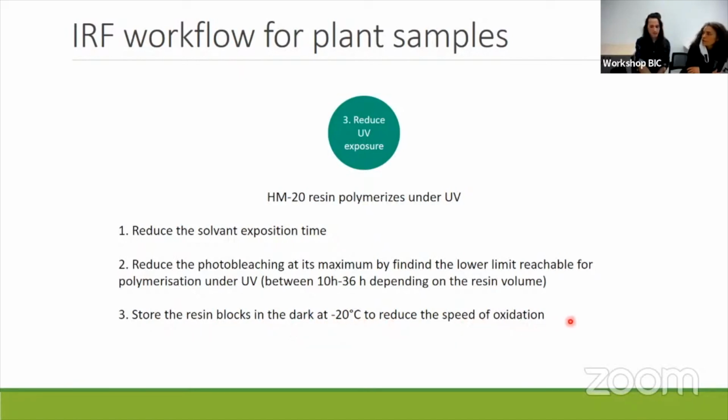We noticed that in samples we made a few years ago, the fluorescence is less visible. So when you do your fixation, try to process your resin samples when you can, and not store them too long. We also have the feeling that the surface of the block is less conserved than the deeper part of the sample. In fact, it's as if the oxidation is more important on the surface.